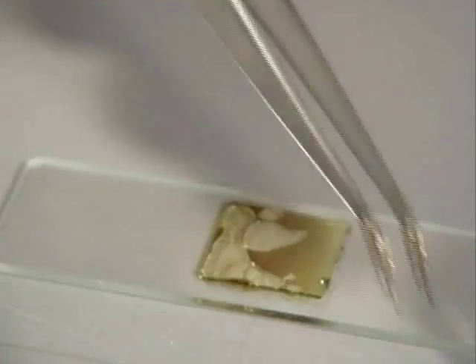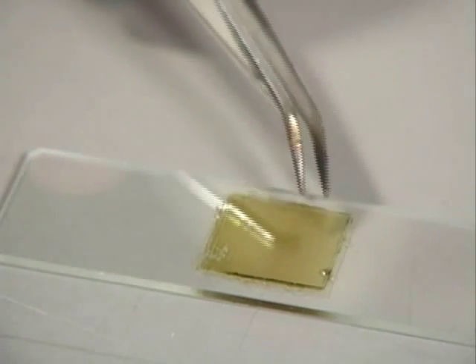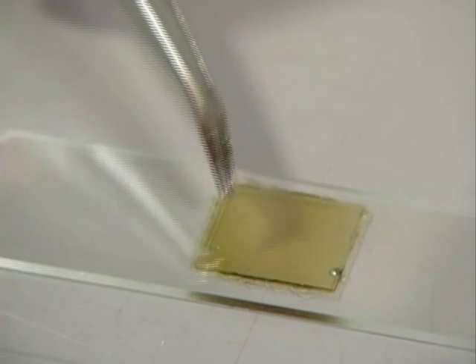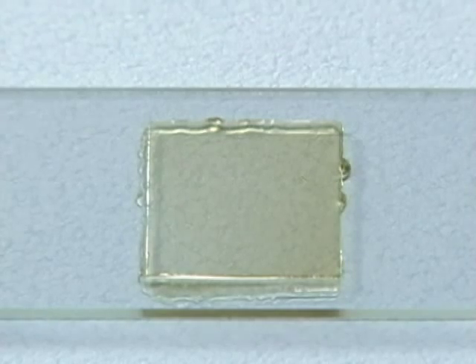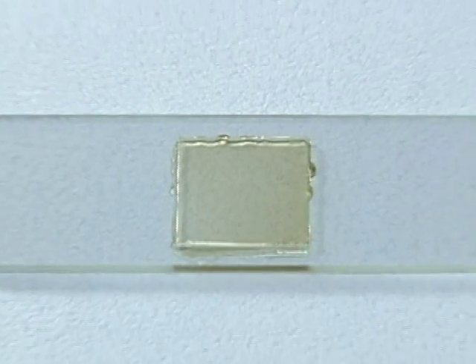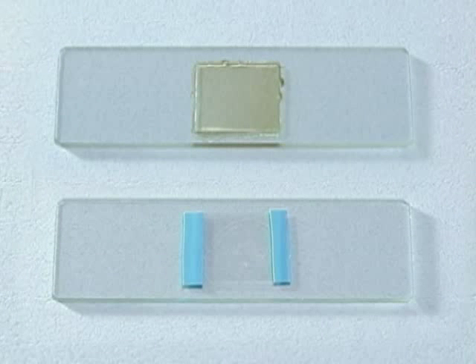Once this happens, the slide is removed from the tile and forceps are used to gently press down the cover slip on the slide and remove any air bubbles. The plurax hardens very quickly, so this must be done promptly. After several minutes, the plurax is completely hardened and the slide preparation process is complete. Whichever method is used, detailed observation of diatoms is made possible.